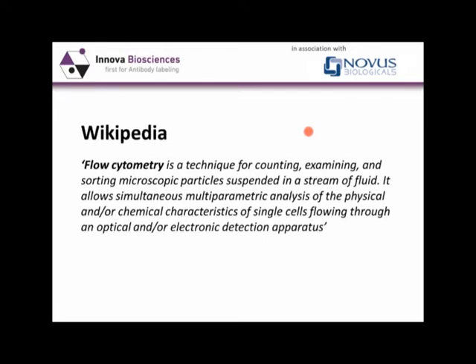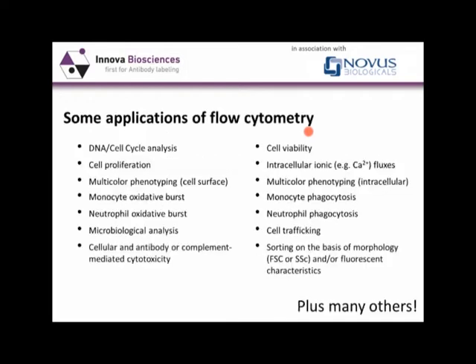What flow cytometry allows you to do is analyze large numbers of cells very quickly indeed, which sets it apart from the microscopy-based techniques. It also allows you to measure multiple parameters on a single cell, which again has an advantage over the more commonly used microscopic fluorescent techniques.